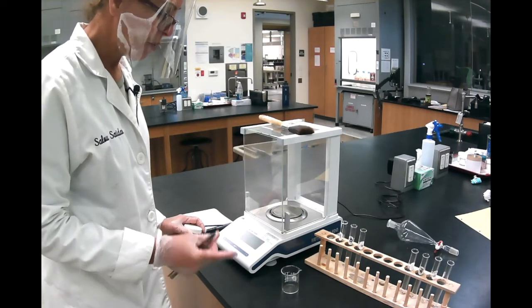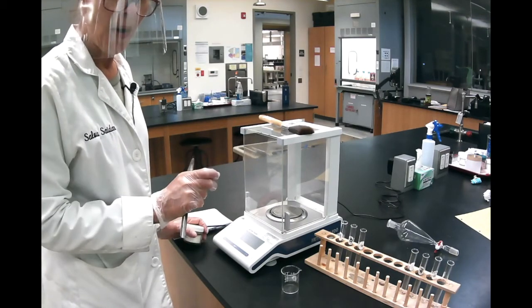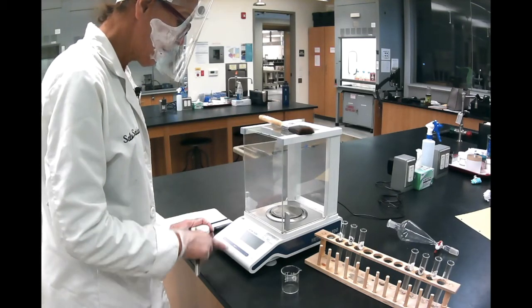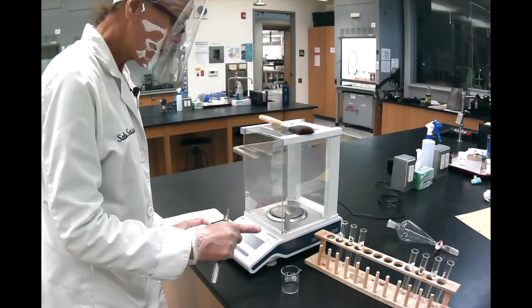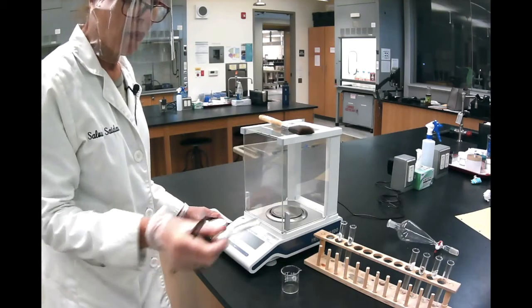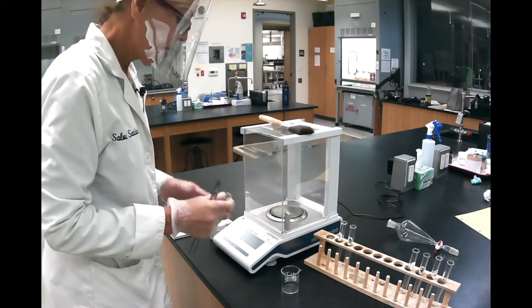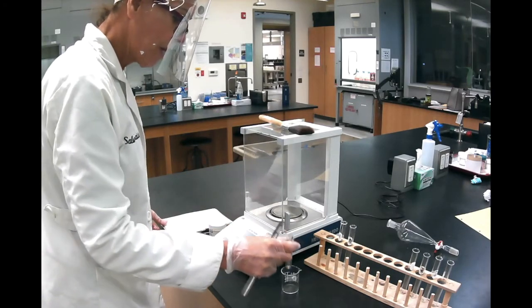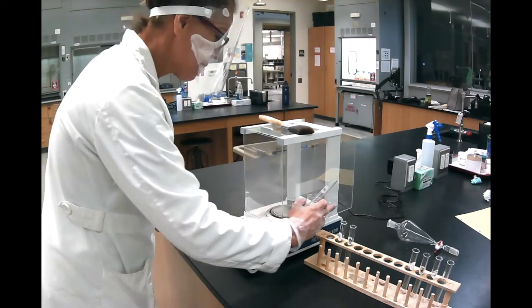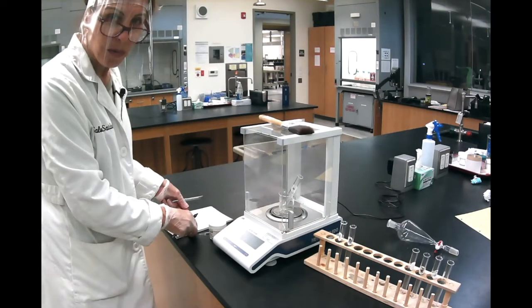And the reason we weigh by subtracting is so that if there is any calibration error, it will be subtracted when you subtract your numbers. So first step, we want to weigh 100 milligrams in a test tube. I can't weigh it directly in the test tube without holding the test tube on the balance. So what I'll do is weigh the beaker with the test tube. So here we have, and make sure you have a little notepad to write your mass.